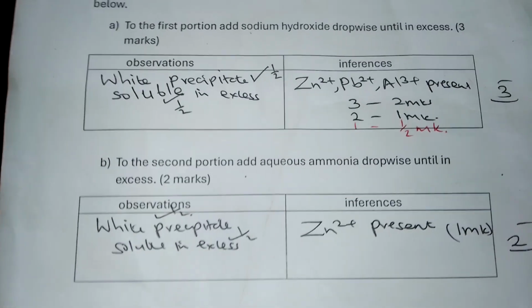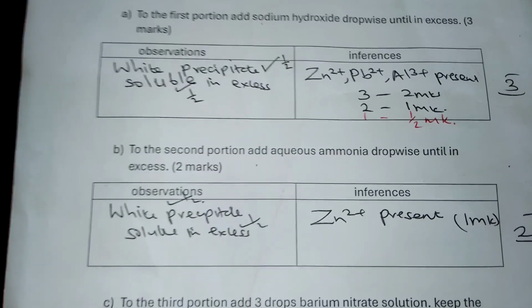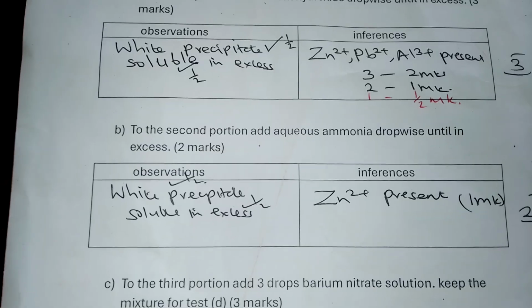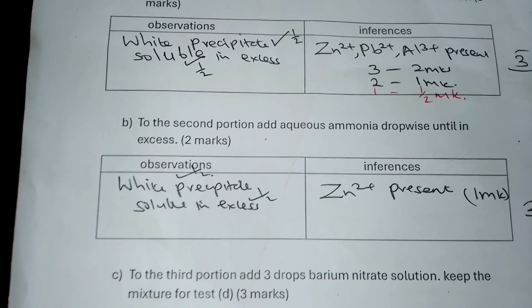To the second portion, we added aqueous ammonia dropwise until in excess. We also found a white precipitate, which was soluble in excess, so we concluded that zinc ions are present.